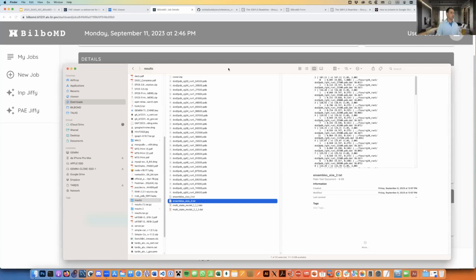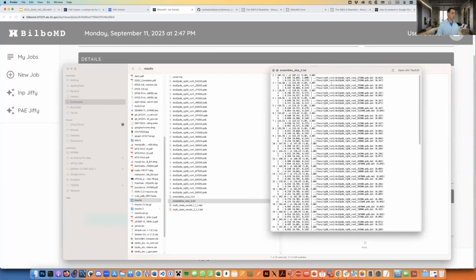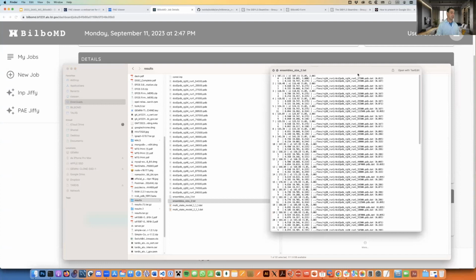Yeah. One way to do that, of course, is you can take this set of PDB files, zip them up and dump them into Fox and your SAX profile, and it'll do the minimal ensemble search. But that's what it's doing. That's what we're doing. I know, but I'm just saying to make sure that Bob isn't confused. I think because like you said, those TXT files are hard to interpret. They have that information, the correct one, like that ensemble size of 2 is saying these are the 2 best ones, and they're in there, those 2.